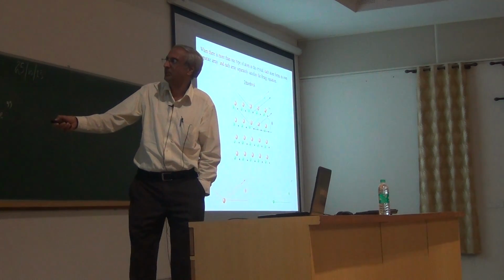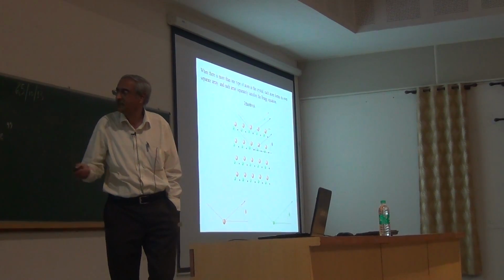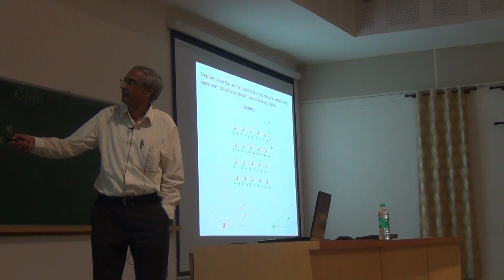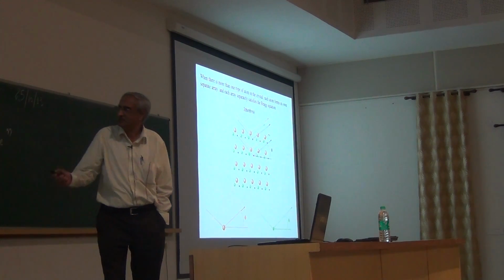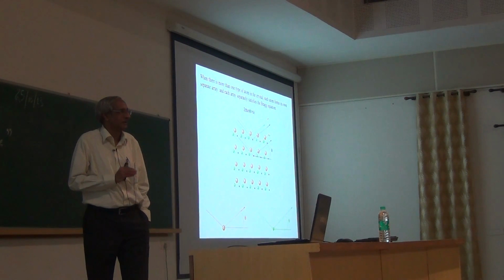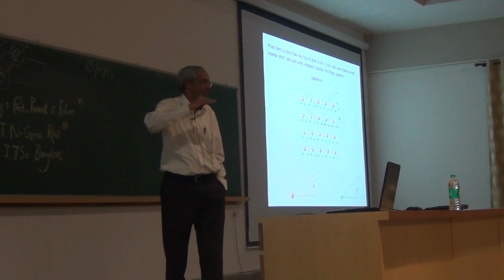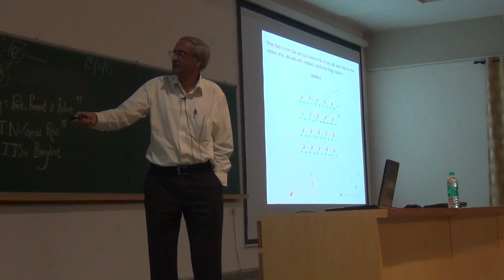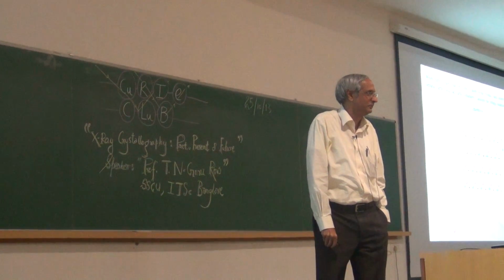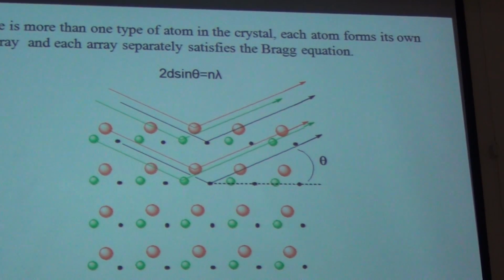And these are the various reciprocal lattice points from which X-rays get reflected, as was conjectured by Bragg and Bragg. So you get this diffraction pattern, depending upon 2d sin theta equals lambda. So this is the hypothesis. You see what is very interesting about this. Somebody asked me this question in the afternoon, so I searched for this slide from my collection, sitting in Anshu's house, and took it out. What is very interesting is that if you see this lattice point, there are no atoms associated with that lattice point. The atoms are in other places. The green atom and the orange atom, these two atoms are the ones which are actually participating in the scattering.